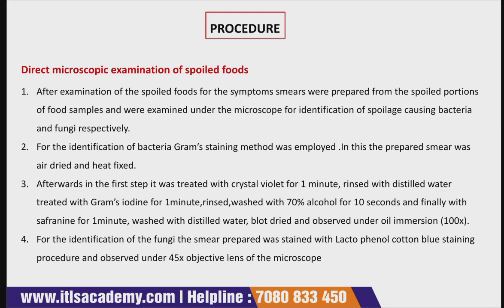And after that, you examine the smear. You put the smear under the microscope, and you visualize and identify the spoilage that is caused by bacteria and fungi respectively. So for the identification of bacteria, the gram staining method was employed.